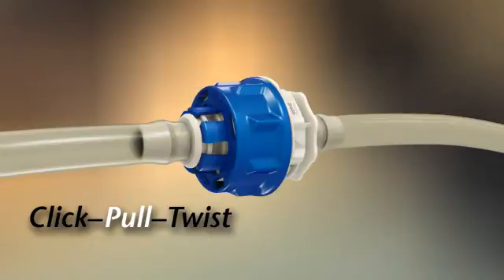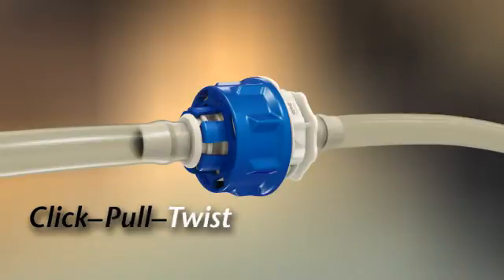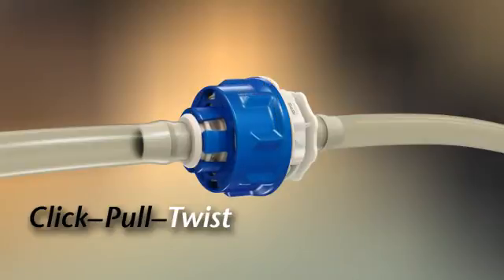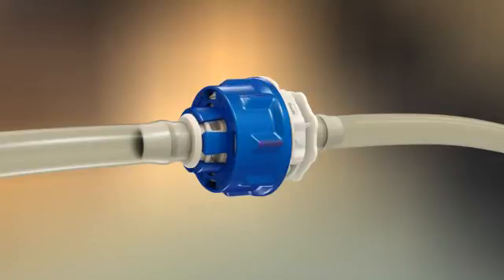To complete the connection, simply twist the blue lock ring clockwise until confirmed by the final Kolder click and alignment of the lock ring rib with the arrow indicator on the connector body.